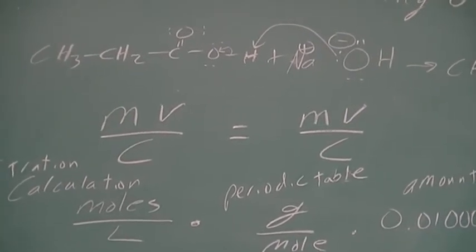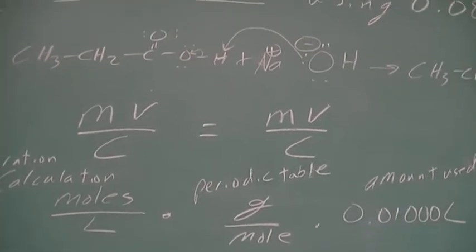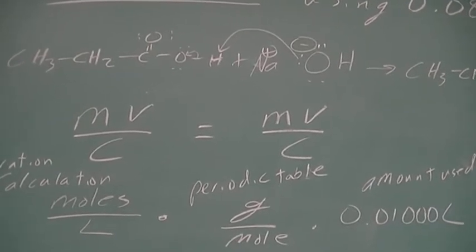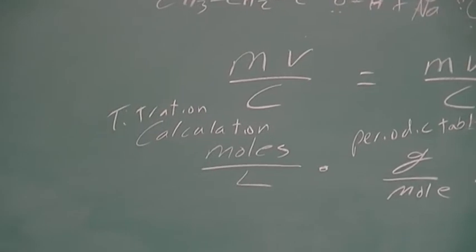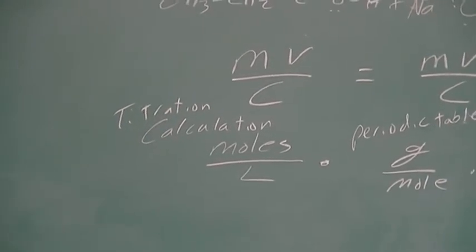We're going to use 10 mLs of this acid. And we know the molarity of the base. I gave that as 0.083 molar. And then we will get the volume of the base by our titration. And again, both coefficients are 1. And so we will calculate the molarity of our acid, so the propanoic acid.